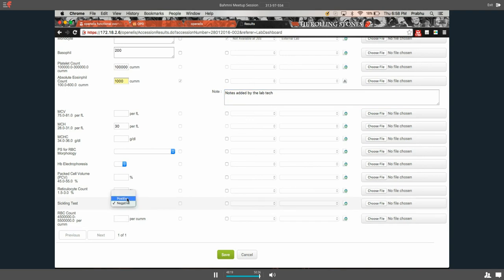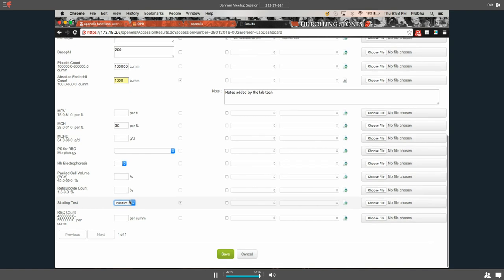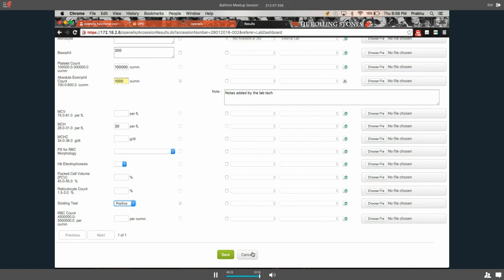But there was also a procedure where they could dilute the sample, since I think it was essentially a percentage. By doing a 2-to-1 dilution, they could get a value from 0 to 35, but with a much bigger error band. So the normal thing was to do the small ones where the error band was relatively small, but if it was up in the 20s and 30s, the equipment would just show more than 17. They just ended up writing notes and putting in a value of 17 or 18, whatever the limit was, and saying really it was above this.